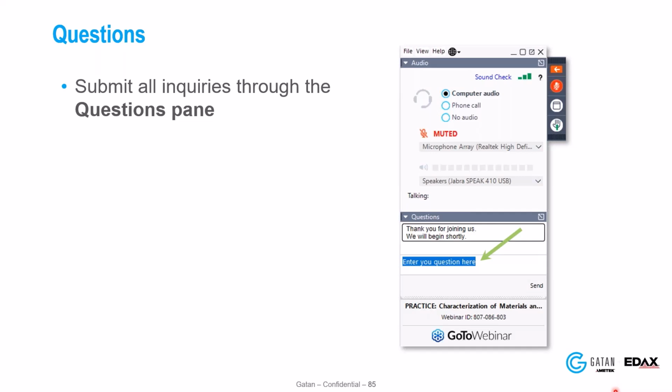Yeah, so we've seen that it can improve indexing on really fine-grained materials. We've looked at cross sections of nano indentation, where we can measure similar to the shot peen aluminum, where you get the high deformation zones, and can resolve that grain structure better.